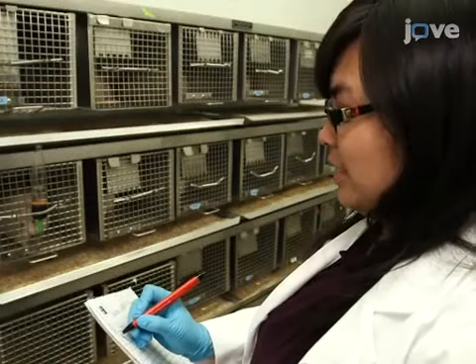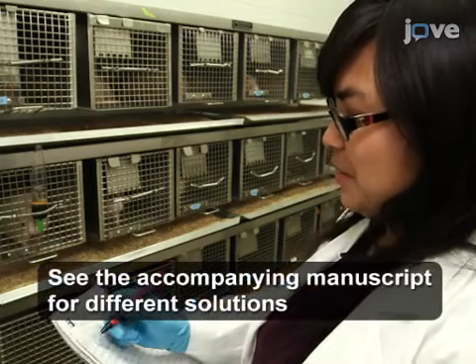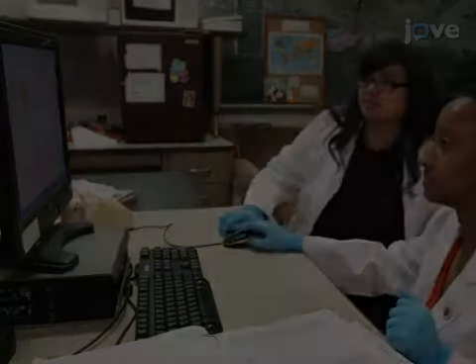Then, perform an intake test on the fifth day on subgroups receiving one of the six solutions. Ensure that the rat samples the solution with short latency.